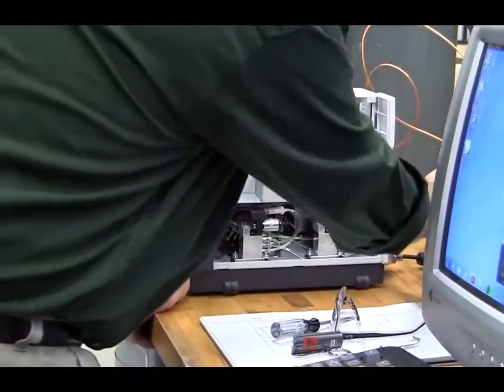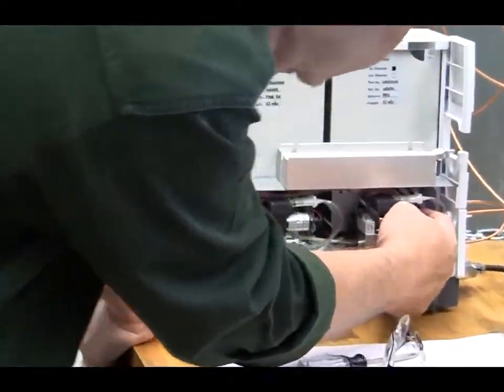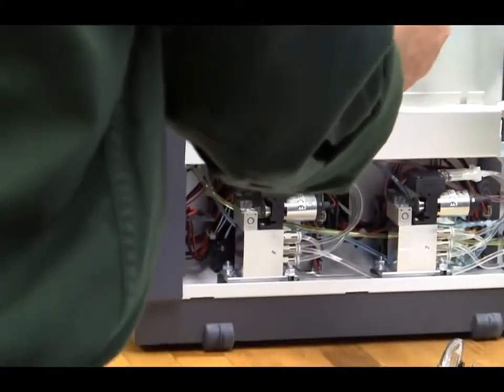Okay, so this is my number 1 carrier, right? Coming through here. And it's coming through here. Going back into this guy. Doesn't make a lot of sense to me, but this would be the number 1 module, number 2 module. Number 1 carrier is going to this one. Number 2 go to this one.